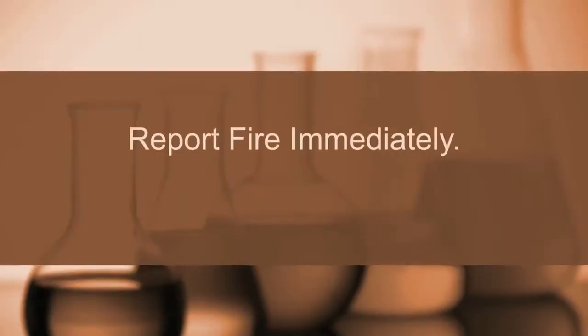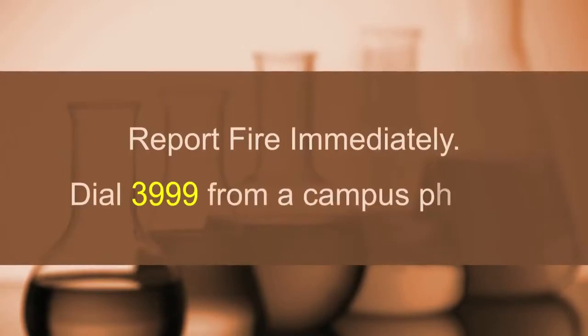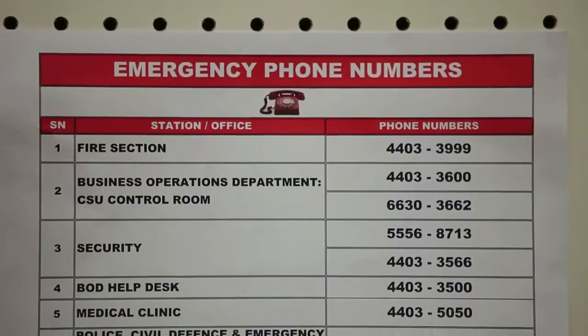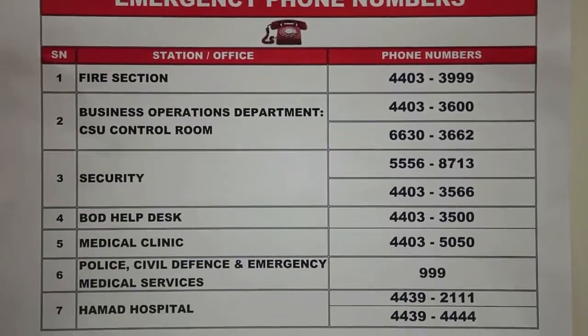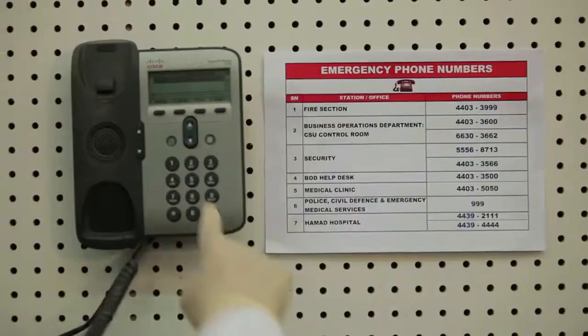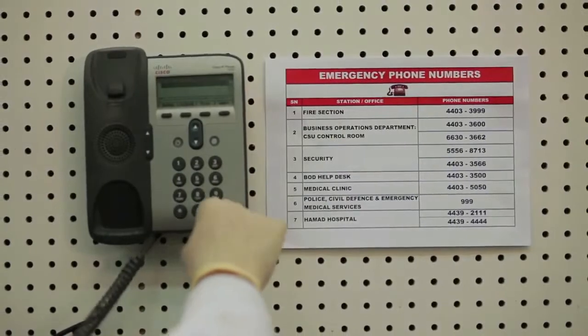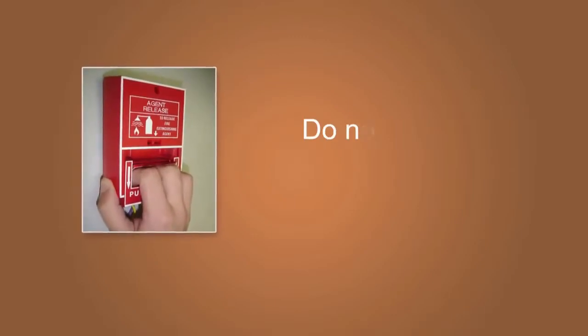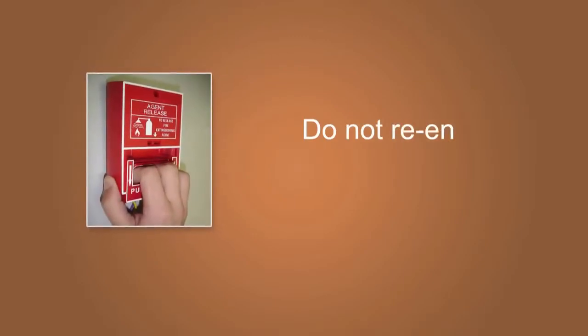When a fire is discovered, regardless of its size, report it immediately from any campus phone. Be prepared to tell the operator vital information, such as what is on fire, where the fire is located, if there are any injuries, and if you are going to use a fire extinguisher. Do not hang up until the operator tells you to do so. If evacuation is necessary, pull the fire alarm and proceed to the nearest exit. Do not re-enter the building until authorised by the fire department.